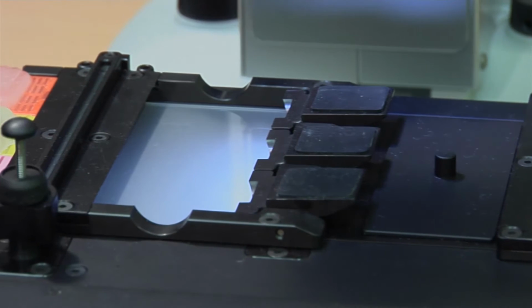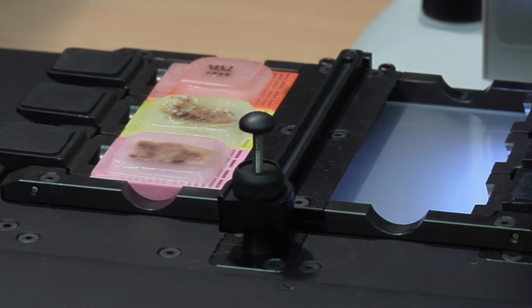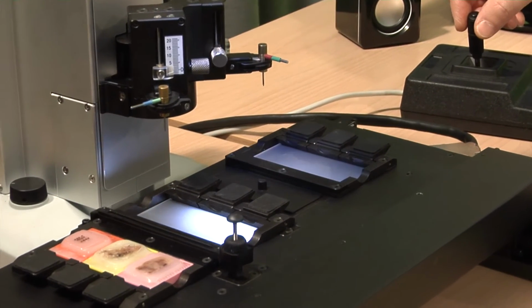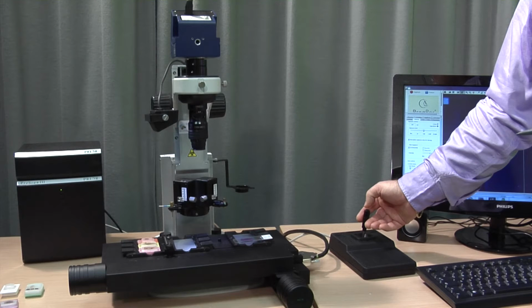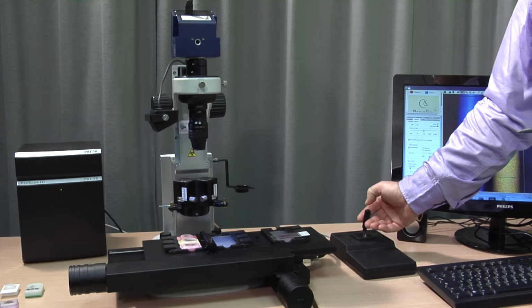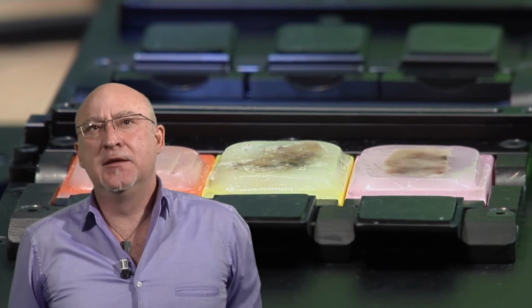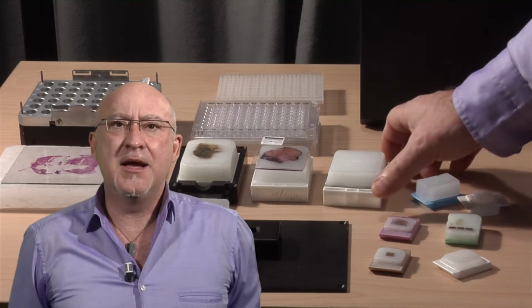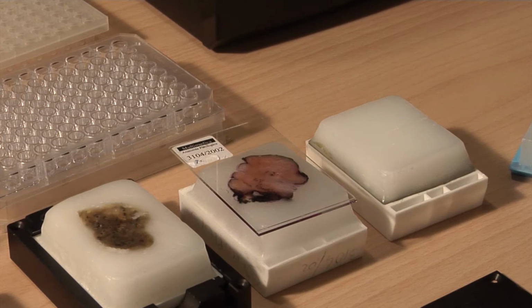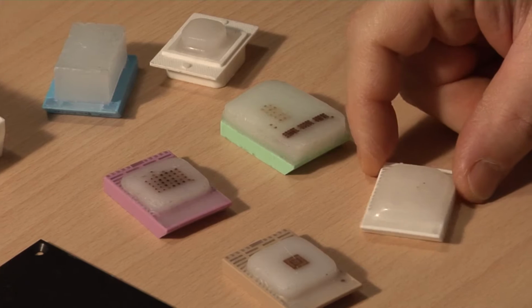On that stand we mount an automatic stage that can be moved also manually via joystick. You have 3 speeds possible, and the stage is soft moving, is nice, and the resolution is very good. It's 1 micron resolution. On that you can mount different items, different geometric blocks, from standard block to macro block to microtiter plates, a lot of different things, so we try to be flexible on that.